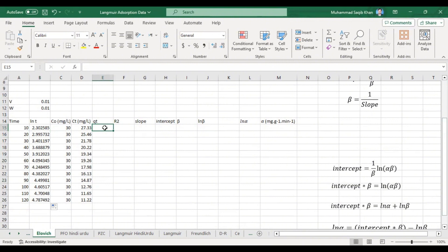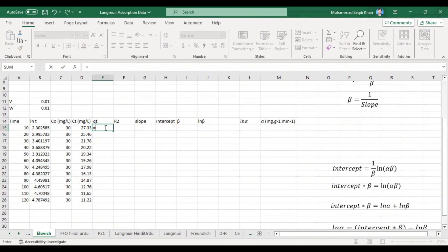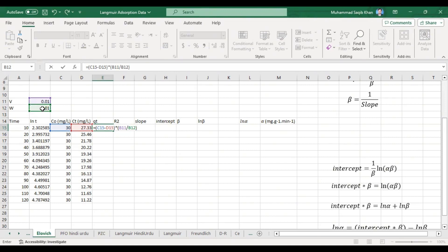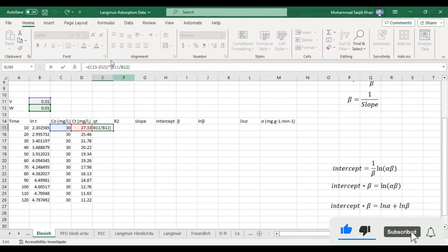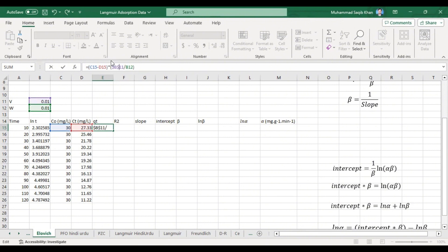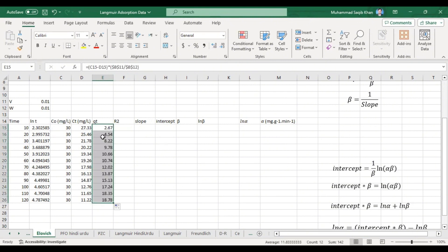Now we will calculate qt by putting the formula: qt = (initial concentration − final concentration) × volume / mass. In our case, mass and volume are the same, so we can simplify to C₀ − Ct to get the qt value. We lock the cell references using dollar signs before and after the fixed values, then double-click to copy the formula down.